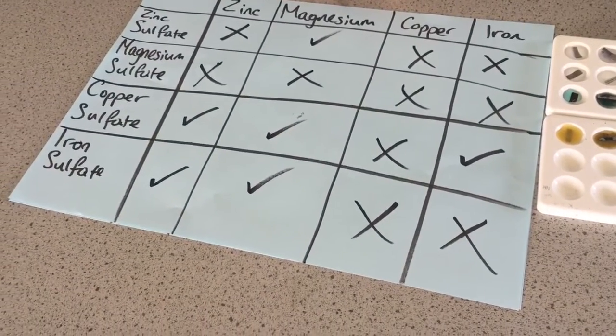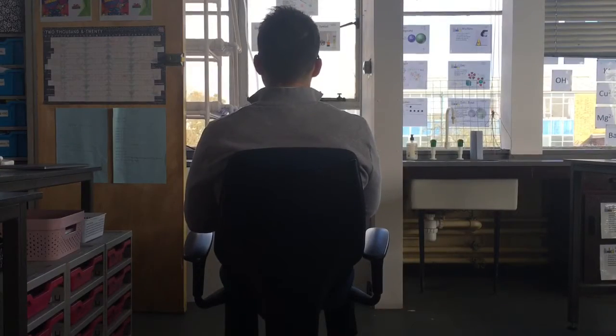Mr. Mulroy, are there any improvements we can make on the displacement reaction? First thing you'll notice is there's a lot of human error in there. When we were trying to spot those reactions, you'll notice perhaps right at the beginning we thought nothing was really happening, and then we went back to it, but we still weren't very sure if a reaction had taken place. So what we would do instead is use temperature change as the gauge of whether a reaction is occurring.